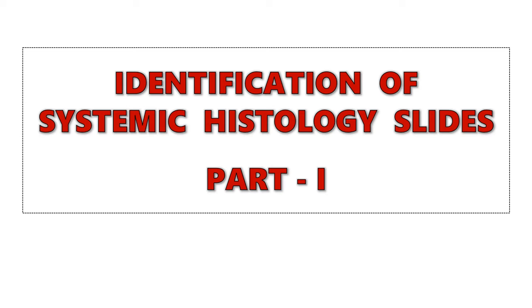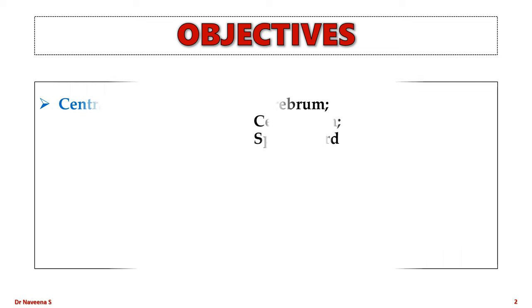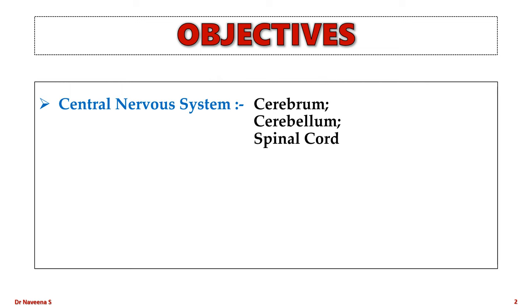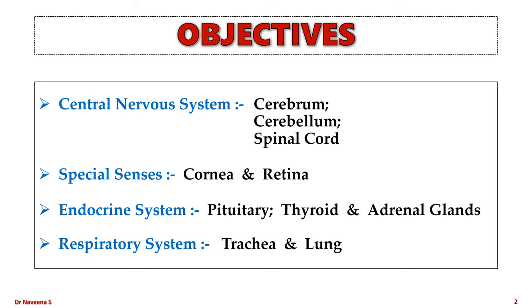Welcome to this video tutorial on identification of systemic histology slides, part 1. We will learn the following slides: three slides of the central nervous system — cerebrum, cerebellum, and spinal cord; two slides of special senses — cornea and retina; three slides of the endocrine system — pituitary, thyroid, and adrenal glands; and two slides of the respiratory system — trachea and lung. In total, we will be looking into 10 systemic histology slides.